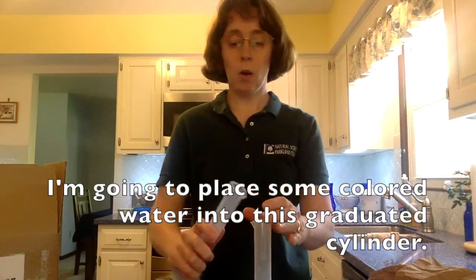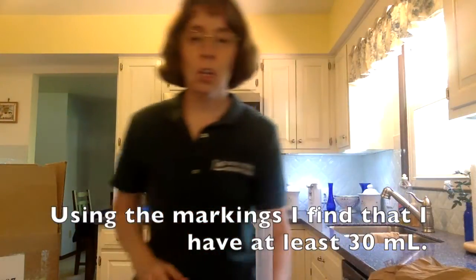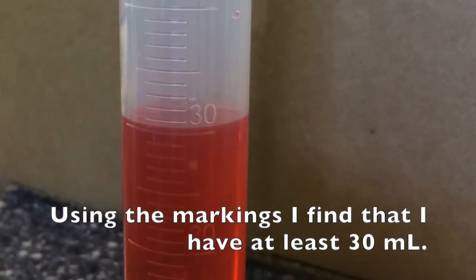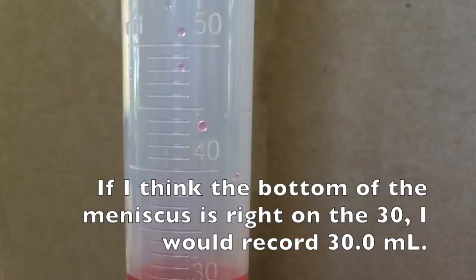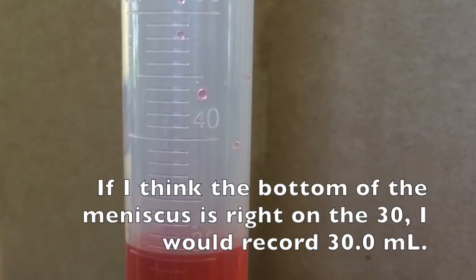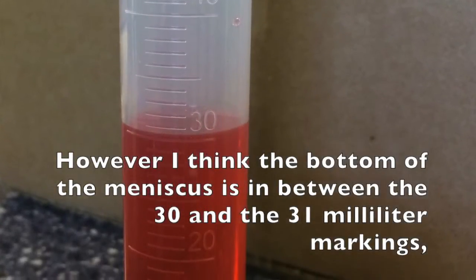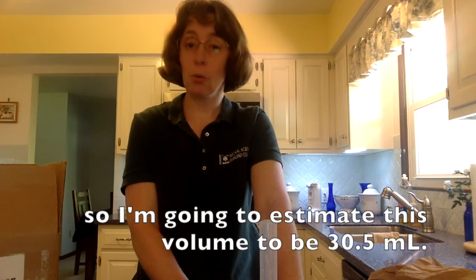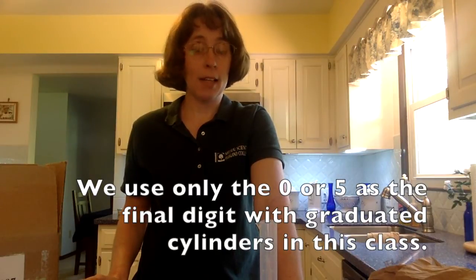I'm going to place some colored water into this graduated cylinder. Using the markings, I find that I have at least 30 milliliters. If I think the bottom of the meniscus is right on the 30, I would record 30.0 milliliters. However, I think the bottom of the meniscus is in between the 30 and the 31 milliliter markings. So I'm going to estimate this volume to be 30.5 milliliters. We use only the 0 or 5 as the final digit with graduated cylinders in this class.